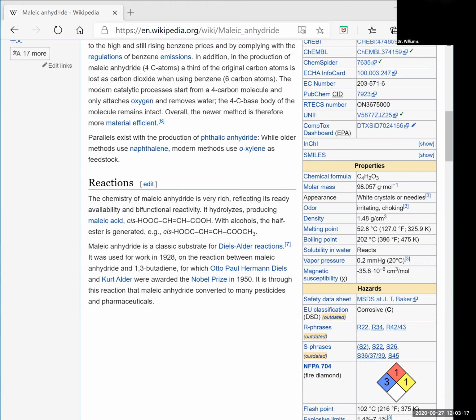So actually, I'm looking at 47 to 56, because for the range of the melting point, 51 represents the first drop of liquid which is formed, and the 56 represents the last bit of solid to melt. And that range gives you the temperature range, or the melting point range for your sample. So in this case, because I know that range, this is the setting that I'm going to use. And by doing this, it will also help you see how we use the instrument.